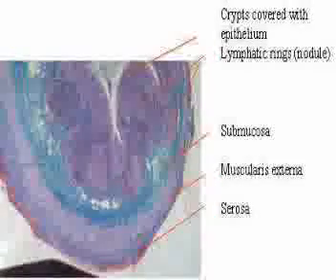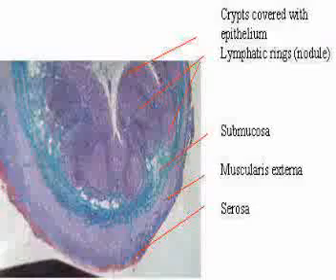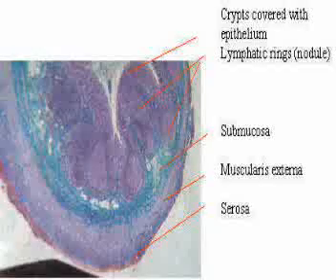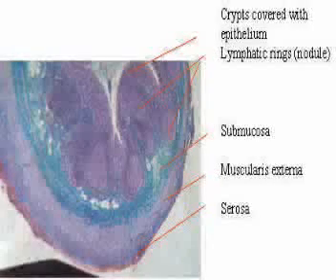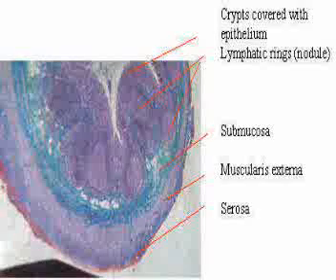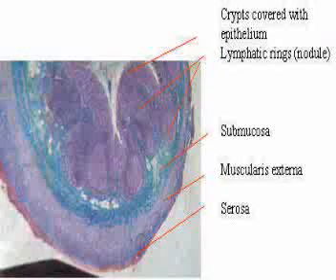Now, small luminal organs can easily be confused with the appendix, which for example include ureter, fallopian tube, and vas deferens. The vas and the ureter have very thick muscular coats with very little mucosa or lumen. Fallopian tube can be distinguished by its numerous branching mucosal folds.